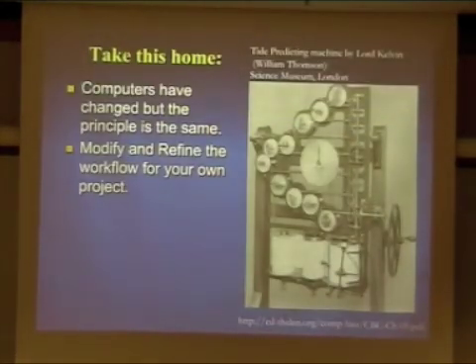So basically, the take-home message is this. The MRC package has been around for a while, but the algorithm in there is pretty robust. So using the same principles, you can still do quite a lot. The second thing is that everyone's project is different, so you may need to modify and refine it for your own project. I put this picture at the end because this is a wave generator.